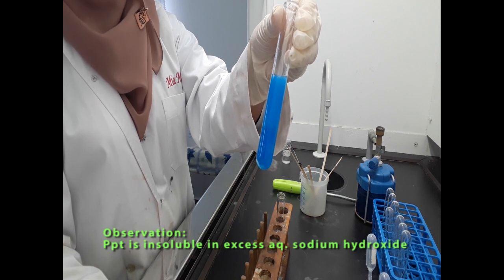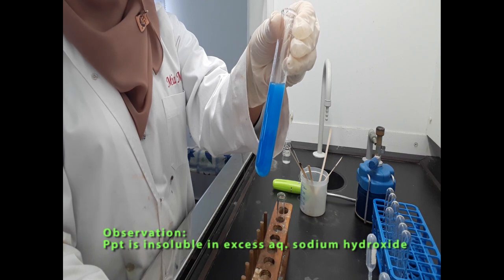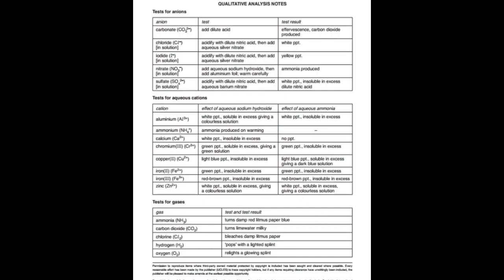Blue precipitate does not dissolve in excess, so the blue precipitate remains unchanged. By referring to the QA notes, the cation present in the solution S is copper because when aqueous sodium hydroxide was added, the solution S turns to blue precipitate and is insoluble in excess.